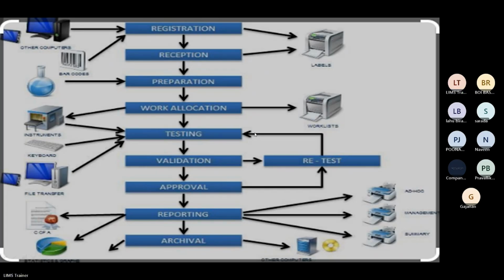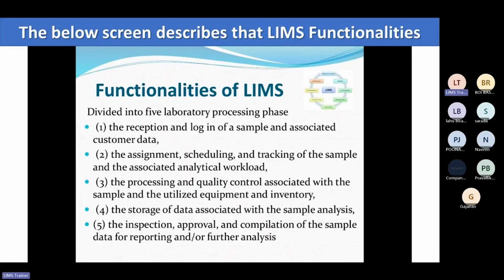Then the different functionalities. What are the different functionalities related to LIMS? Like the reception and the login of the sample. Whenever some sample is generated in the industry, it is required to be received by the laboratory, and it is also required to be logged into the software. Then comes the assignment, scheduling, and tracking.